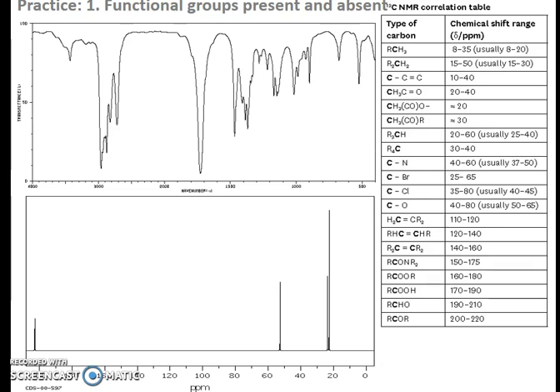So that ties in really nicely with what we're seeing in the IR spectrum. The other thing that stands out is if you have a look at the two peaks down at about 25 ppm, you'll see that one of them is double the height of the other. That doesn't necessarily mean that you have two carbons in that same carbon environment, but it might, depending on what other information you have.